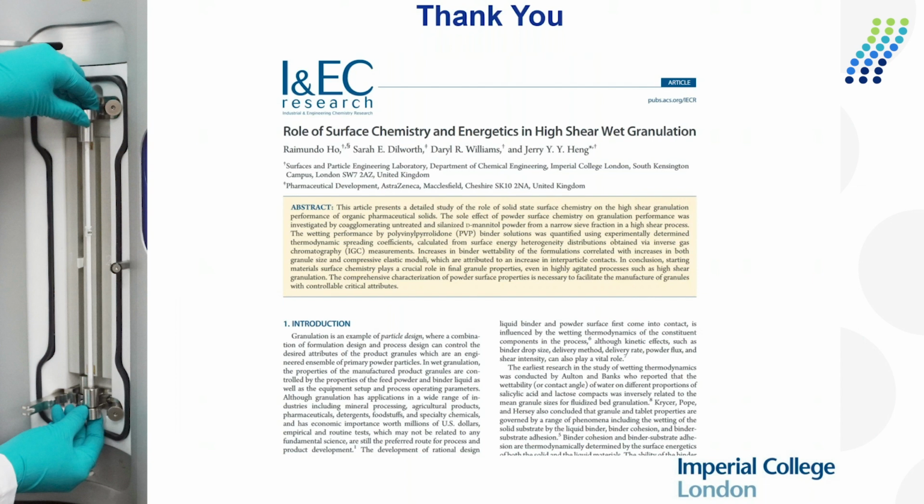In fact, we would prefer that because the water molecules potentially can sample all the surface. The only thing that can get a little bit complicated is if you've got materials where your probes might dissolve in. You have to be a little bit careful about that. But generally speaking, the organic vapors will sample all the surface, and generally we think that's probably a good thing.